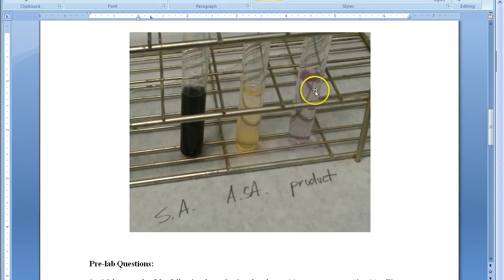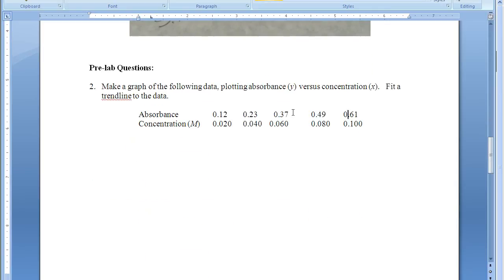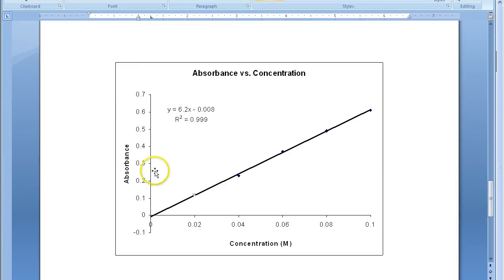If I scroll back up to this unknown that we just qualitatively looked at last week and said, it looks like there is some salicylic acid in it. If we put this solution into our spectrometer and record now an absorbance for that solution, we can use this equation to determine the concentration, the x, the concentration of that solution, how much salicylic acid is present in it.